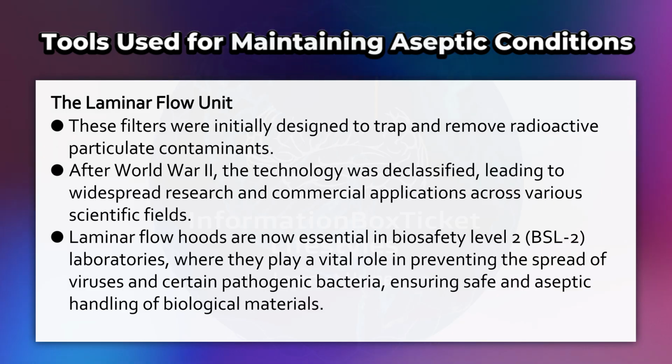Laminar flow hoods are now essential in biosafety Level 2 (BSL-2) laboratories, where they play a vital role in preventing the spread of viruses and certain pathogenic bacteria, ensuring safe and aseptic handling of biological materials.